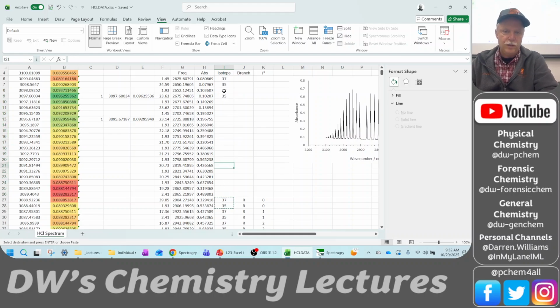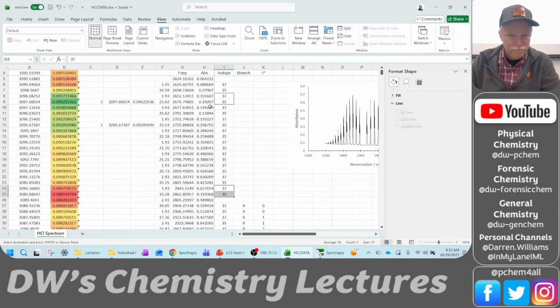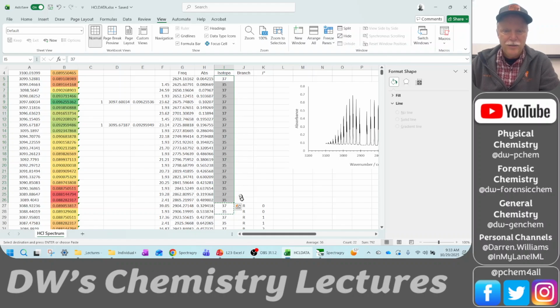That's weird. Why is it doing it that way? Okay, Excel's being funny to me. I don't know why it won't let me paste all of them. Oh, because there's an odd number. Do we have a noise peak in there somewhere? Oh, up here. That's why. I just didn't scroll up far enough. Okay, there we go. And these are all P branches.